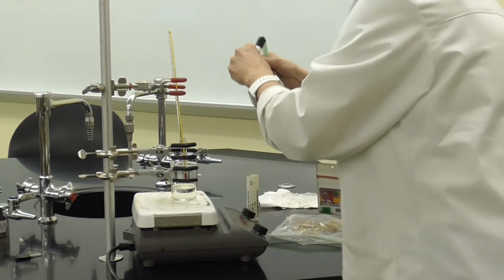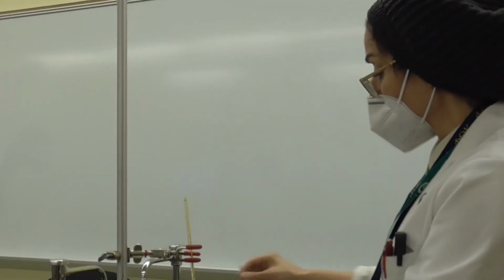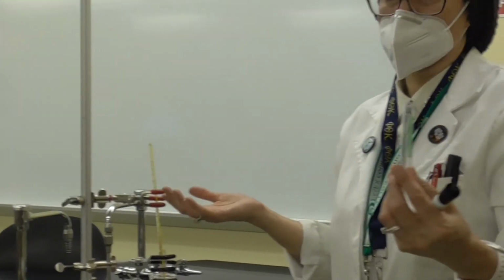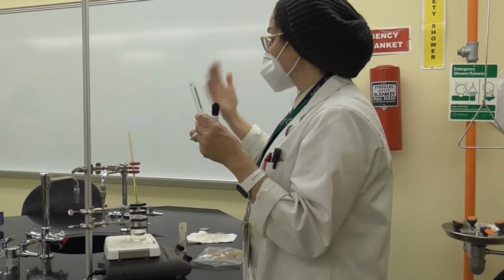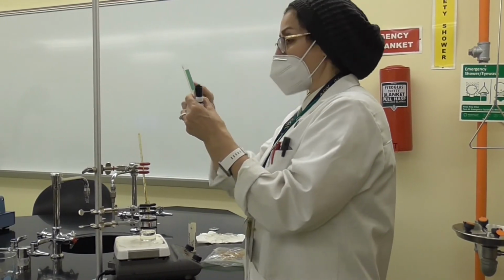Put it upside down here, and then you're going to hold it. The thermometer has to be inside because we want to measure the boiling point, right? The reason why we're putting this upside down is that when it is boiled, the liquid is going to go inside the capillary tube.